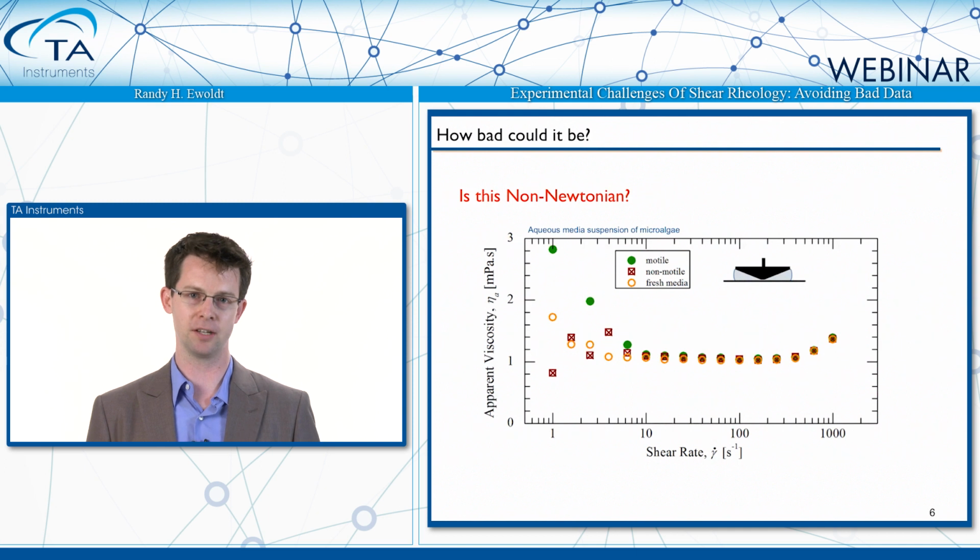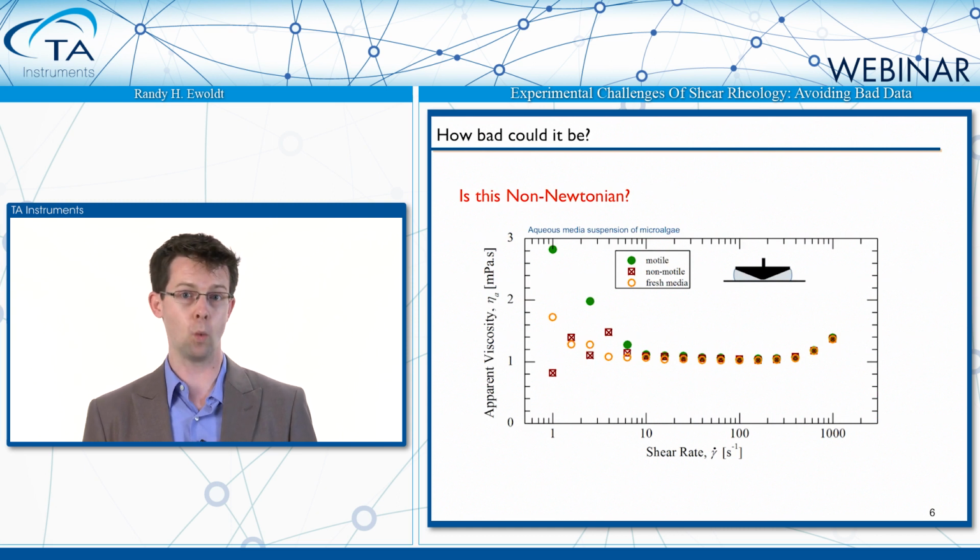This is a flow viscosity curve that's plotting the apparent shear viscosity as a function of shear rate. If something's Newtonian, it looks like a flat line on this curve. And if it's water, it's a flat line that has a viscosity around 1 millipascal seconds, around 1 on this coordinate. You can see the liquids that are on here, they're actually all water-based.